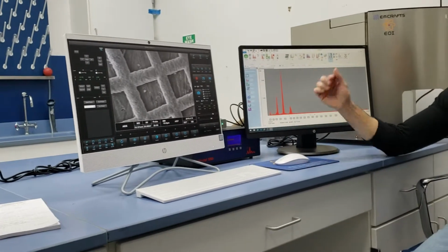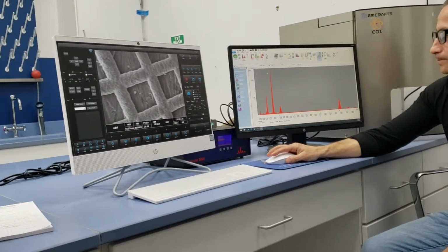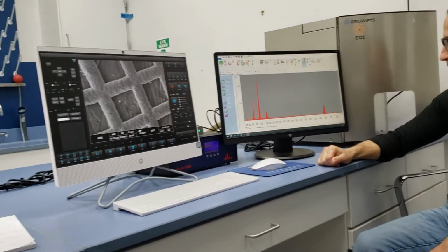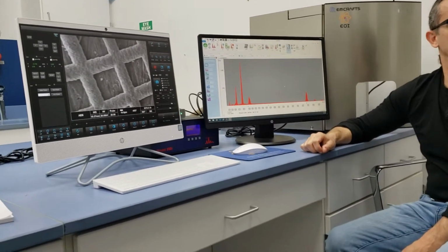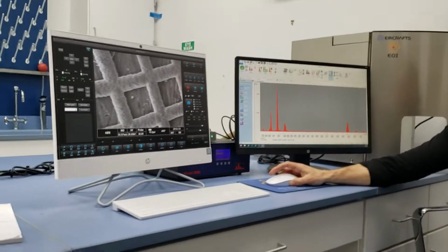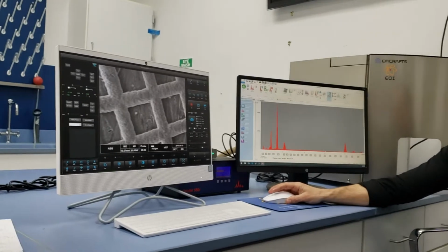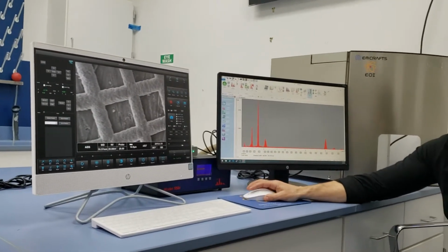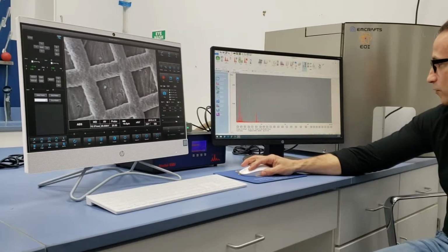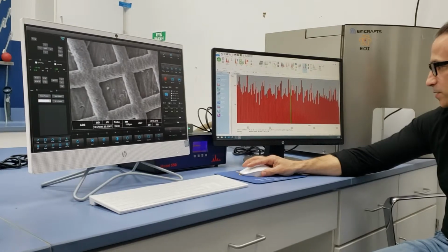Well, it stopped at 20 because that's what my default was in that other window. So it acquired a Spectra. So here's a Spectra. Great. Okay, what is that? So this is a KEV scale. Right? That's 1 KEV, 2 KEV, 3 KEV, 4 KEV, 5 KEV, 6 KEV, 7, 8, and so forth, right? If I shrink the window, it goes from 0 to 40 KEV. If I open the window, it'll go in betweens, right?